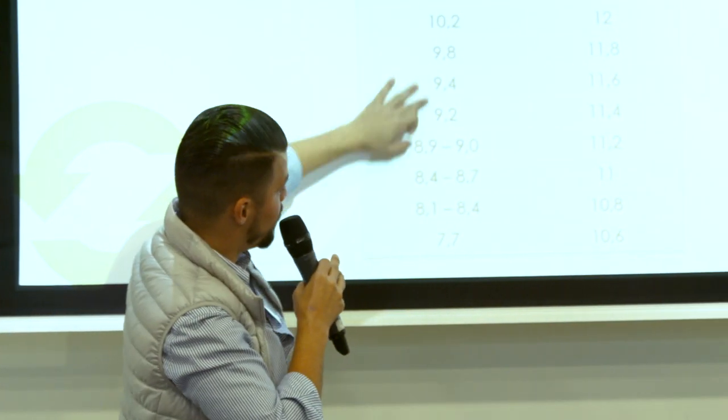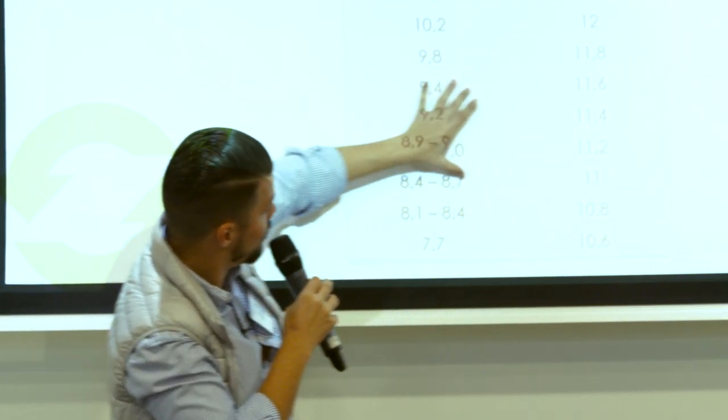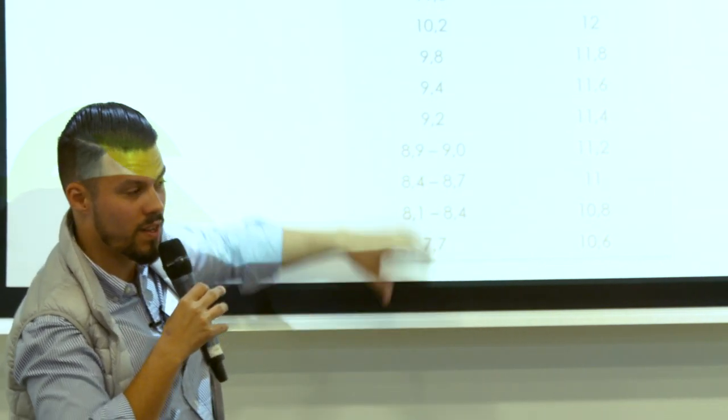So we bought all these articles, we bought all these standardization procedures from ISO to know how to do this. And these are the results that you should expect from the coffee. The safe zone, which is around here, right? Usually in coffee, you agree? So the safe zone here should represent that in the new moisture measuring systems.